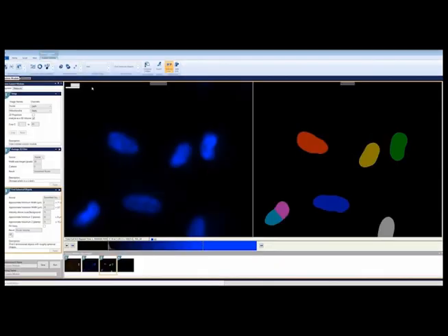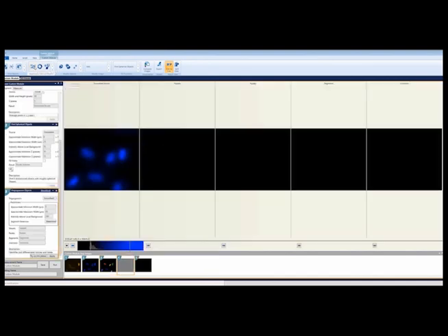The next thing we need to do is segment out the mitochondria, and if possible, differentiate between healthy and unhealthy mitochondria. The healthy mitochondria are long tubes, and neither of the 3D segmentation steps work well with tubes. So it is a good time to switch to the second approach to finding 3D volumes. Segment the images in 2D, then connect the 2D segments into 3D volumes. This gives us access to a lot more segmentation options.